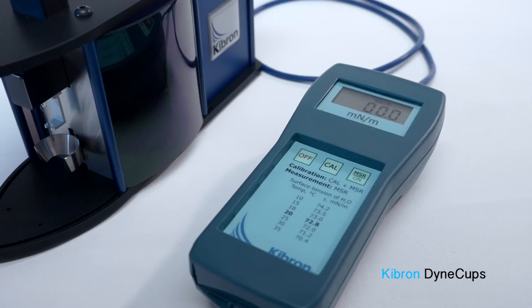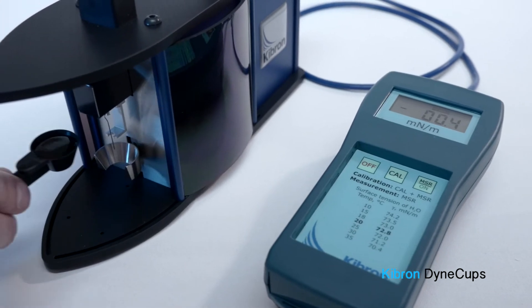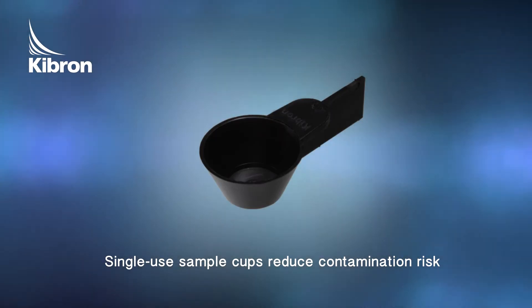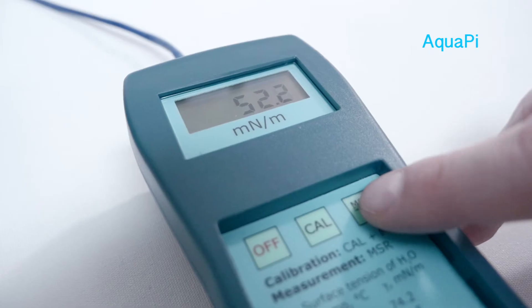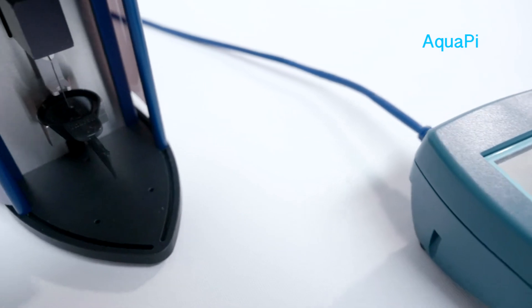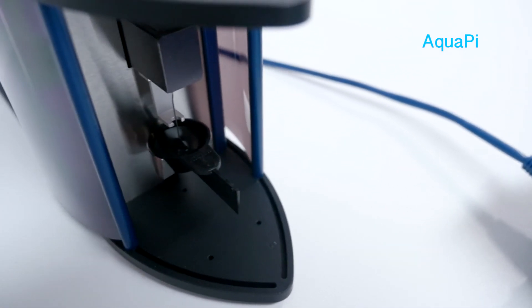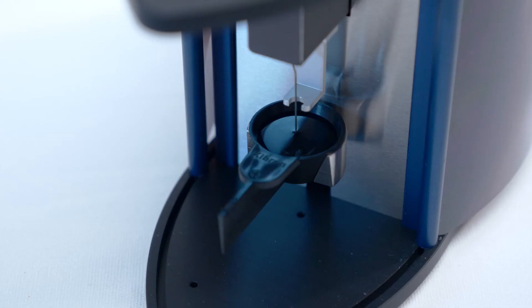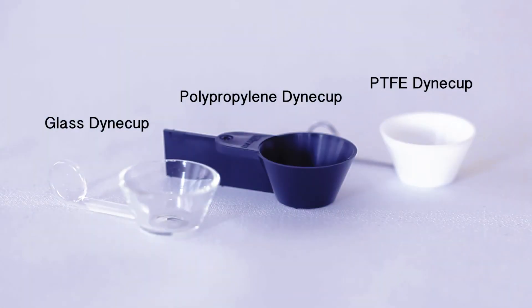The maintenance station gives storage for up to five DIME probes and the ability to flame clean them without having to hold them by hand or forceps. Samples are introduced into the AquaPie using disposable sample cuvettes. The DIME cup's default sample volume is 3 milliliters. These single-use polypropylene DIME cups avoid contamination from previous samples. Kybron also offers clear glass washable sample cups and white PTFE sample cups for higher resistance against reactive samples.